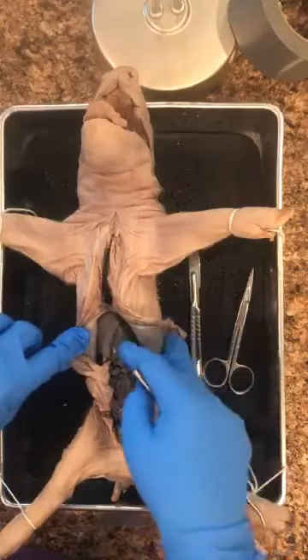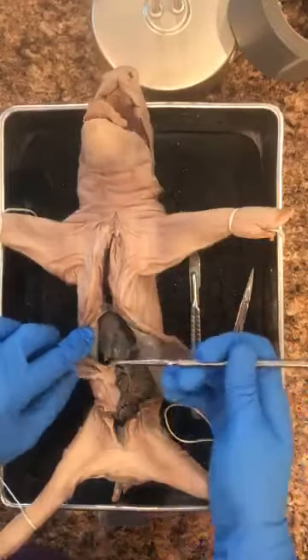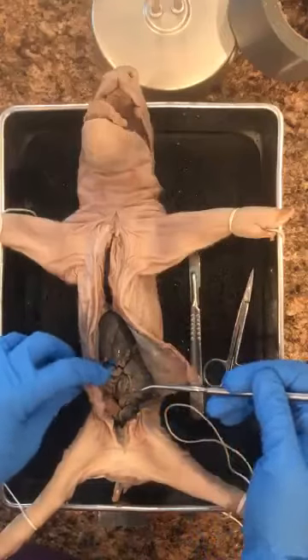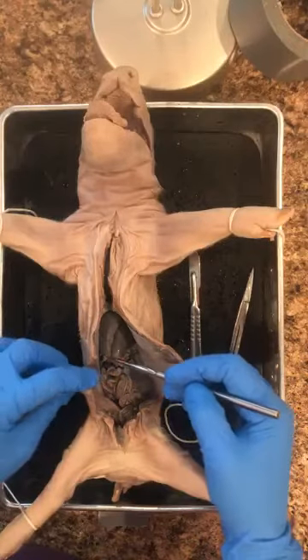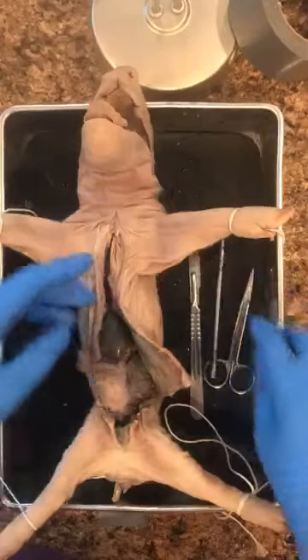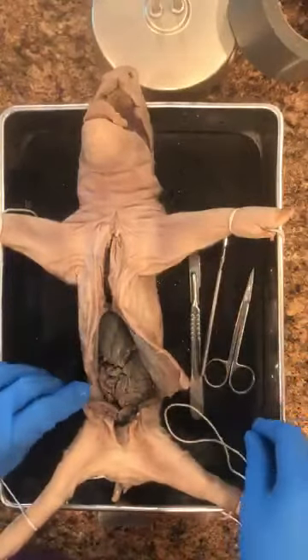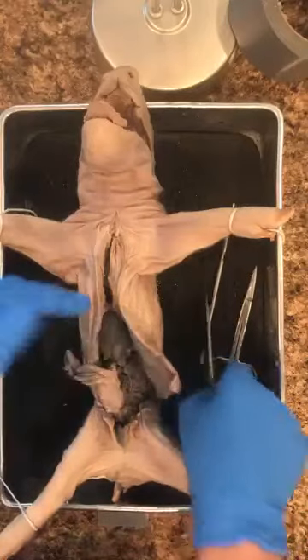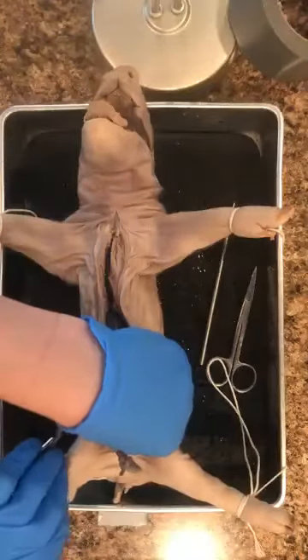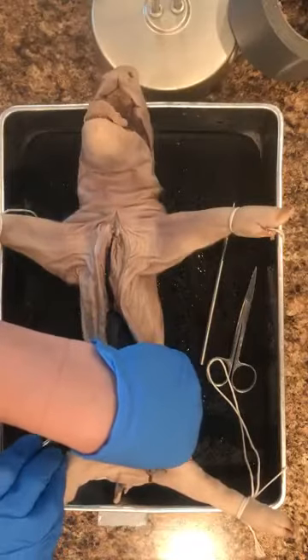There are multiple lobes of the liver here. And then the umbilical cord has two attachment points. It's going to attach right here, which attaches to the liver. And then it's going to attach lower down here. So I had to cut that there. There was no way around it because otherwise the umbilical cord would just completely be in the way.